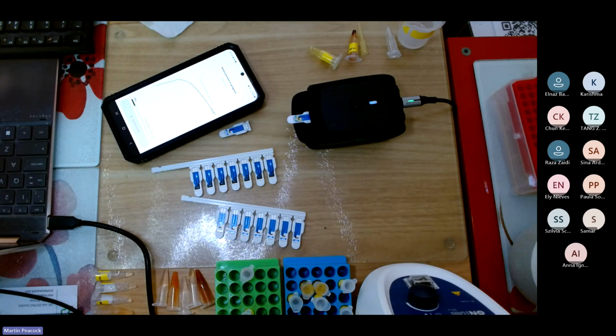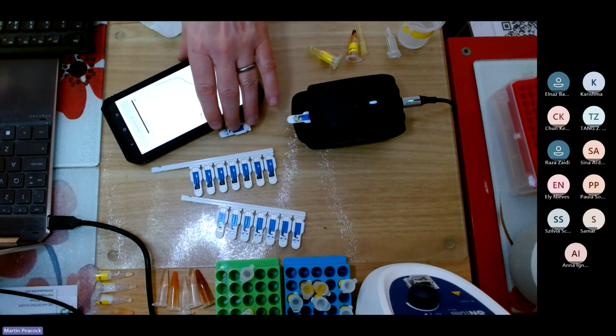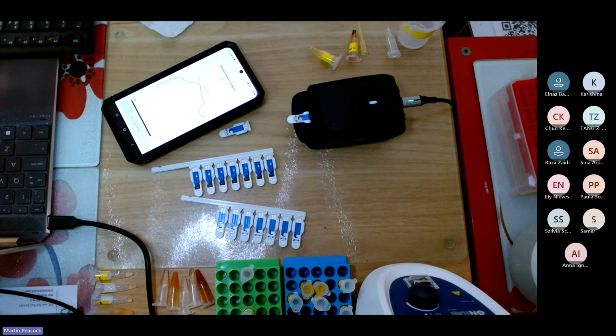What I've basically done is, with that one QR code, and this is the power of this particular potentiostat, I've set up 4 experiments to run sequentially at 4 different scan rates, probably something like 50, 100, maybe 200, and maybe 250. It's running them now. That's the first one coming to an end, then it'll automatically progress to the next one. So there it goes, the next one. You'll see that these assays are becoming faster and faster because the scan rate is going faster and faster.